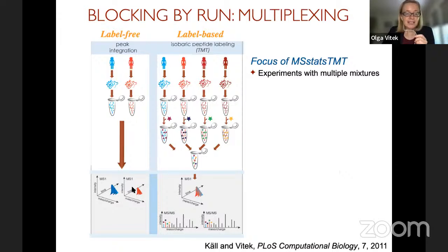When we attempt to compare the abundances of healthy versus disease, whatever artifacts happen in this run and whatever artifacts happen in this run, they add variation and uncertainty to the things that we are trying to compare. On one hand, it's easier to do: the samples do not have to be labeled, and there's no complex processing. On the other hand, the price is that we take longer, but also the between-run artifacts impact our statistical analysis and our ability to detect changes potentially.